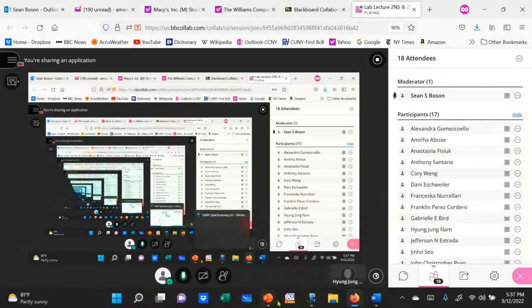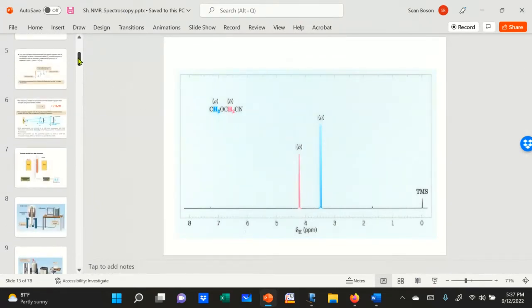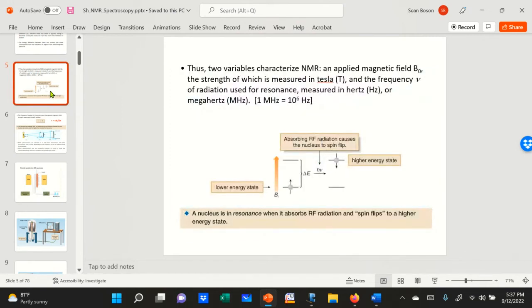Anyhow, going back to this discussion. As I said, the machine operates in a slightly different way when you go to a high resolution machine. However, the machine that you have in your lab, the same room where you have your IR machine, operates practically the way I first described, not with Fourier transformation. There you have a fixed magnet and there is no Fourier transformation.